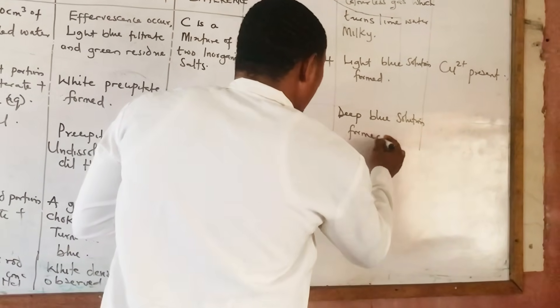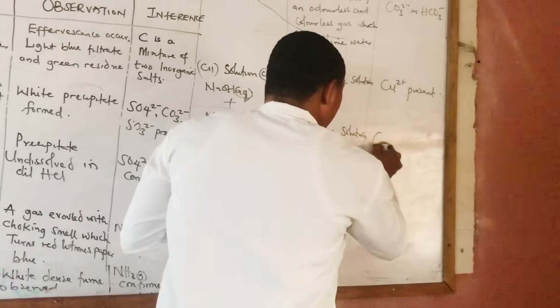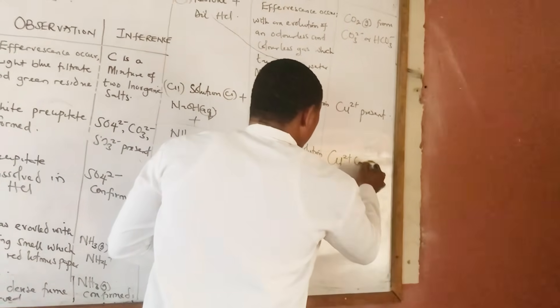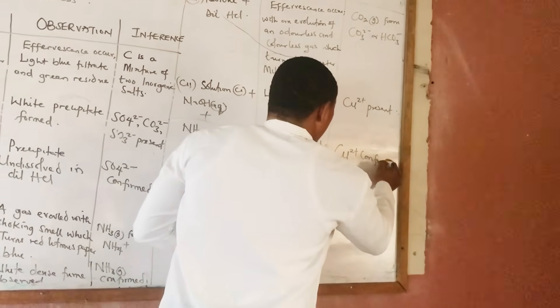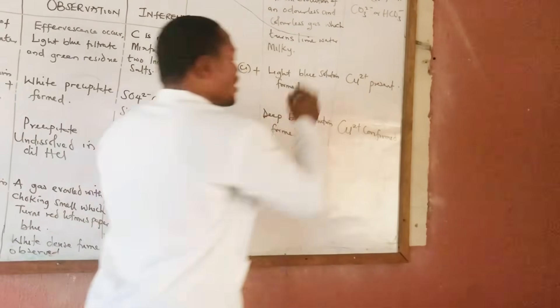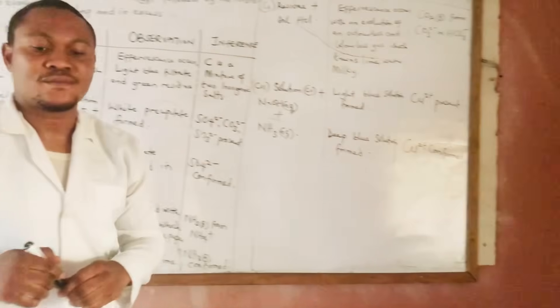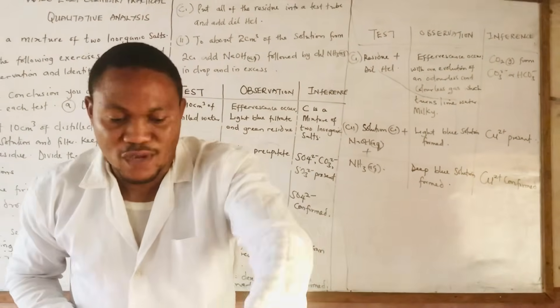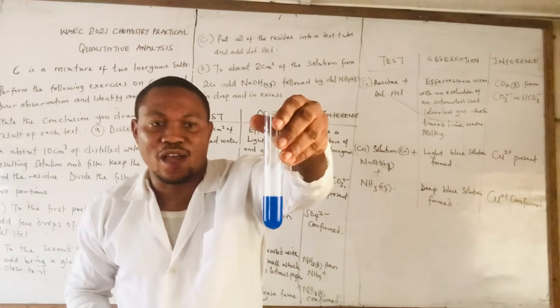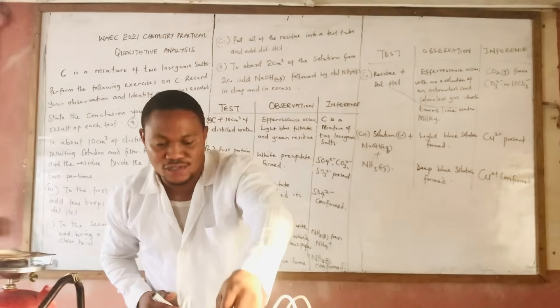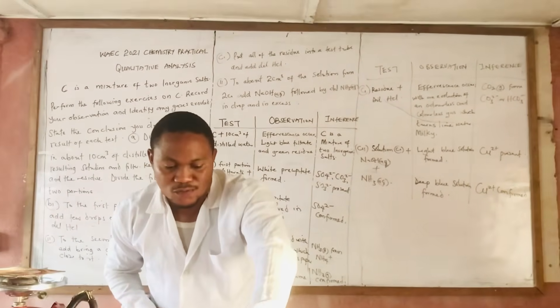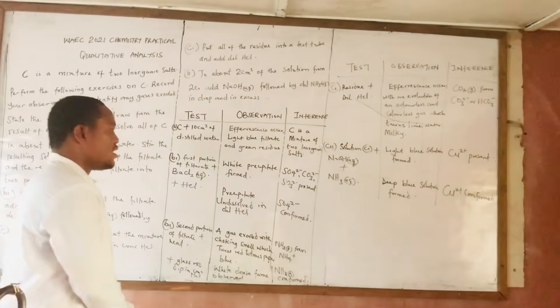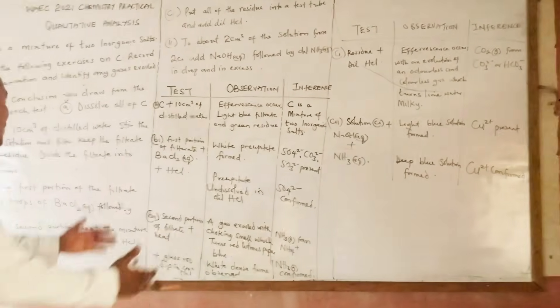When we added ammonia in excess we have a deep blue solution formed, which means our copper(II) ion, Cu²⁺, is confirmed. Can you see the deep blue solution? Cu²⁺ is confirmed.